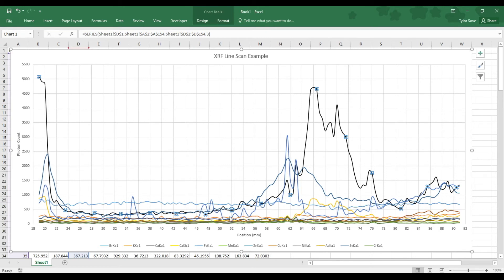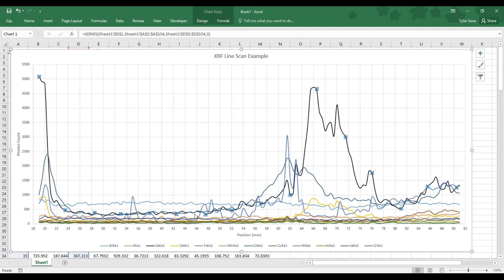For the next 30 or so millimeters, both the zinc and calcium kind of plateau and stagnate. The zinc has a little more variability to it, which might indicate a few things.